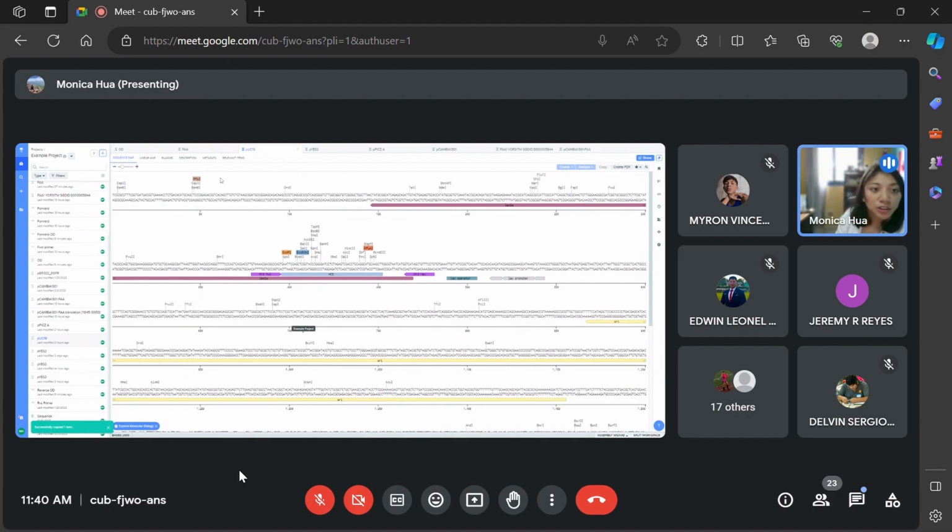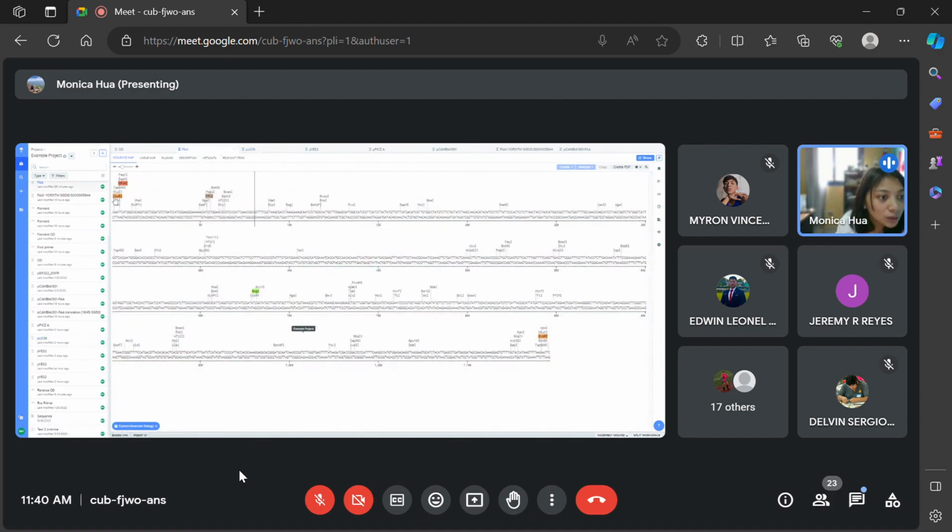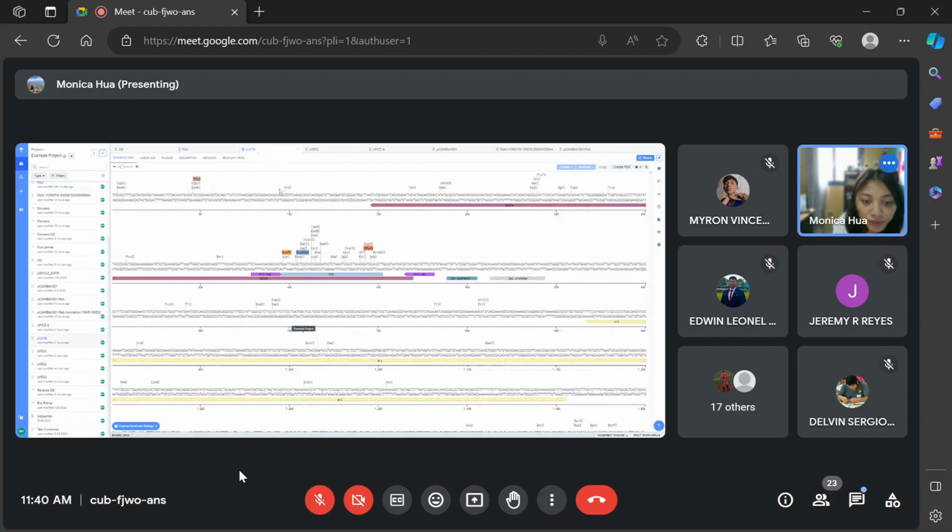All right, so what I would do is I select EcoR1, I think, yes. Okay, so what I want you guys to do is select your restriction enzyme site, right? You delete the restriction enzyme site. So for example, EcoR1 is GAATTC. I'm going to take away GAATTC, okay? Delete.